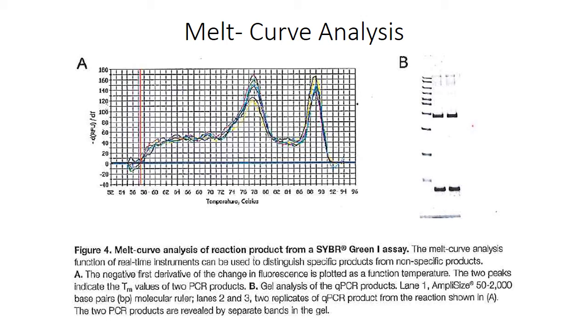When you complete a melt curve analysis, the computer will keep track of the behavior of your product as it cycles through different temperature points, and it will represent it in a graphical form. This is what you see in graph number A. As we're seeing, our samples are following very similar pathways as the peak goes up and comes down. If there were any lines forming that were irregular and not following the flow, that would be a really good indicator that you might have some irregularities, some abnormalities, or maybe just some contamination within your sample.